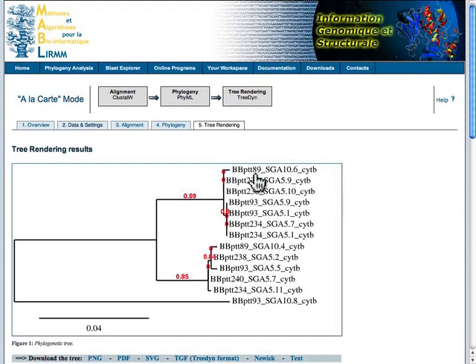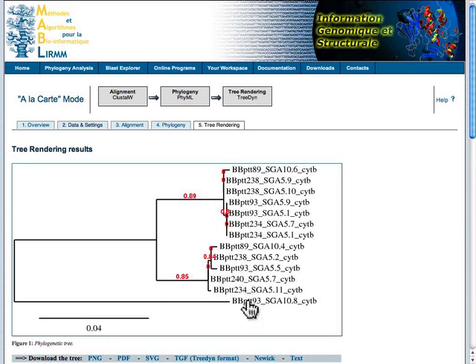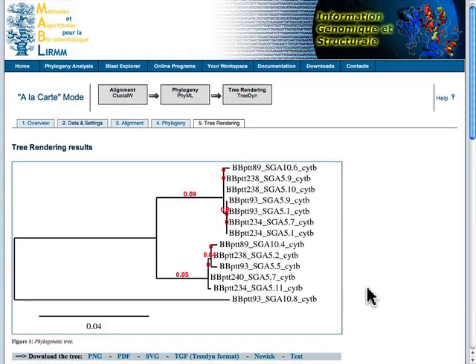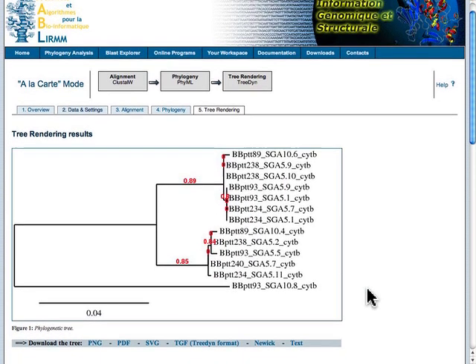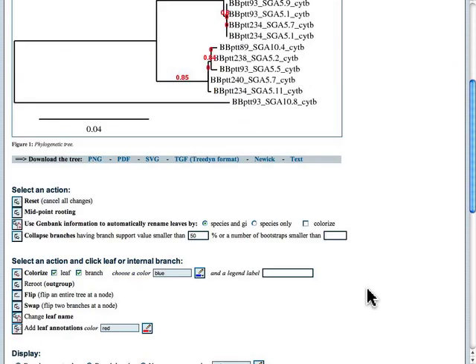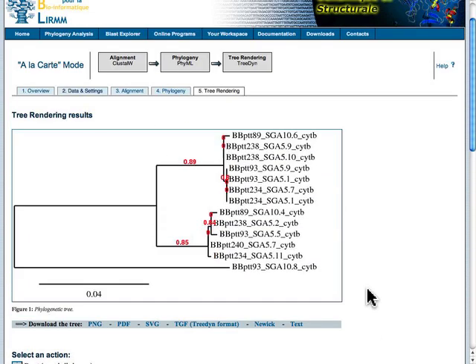You can see here we've got a cluster of sequences that are very similar to each other, another cluster that are very similar, and this sort of outlier here. That's all we're going to do for this tutorial. Come back for the next one.